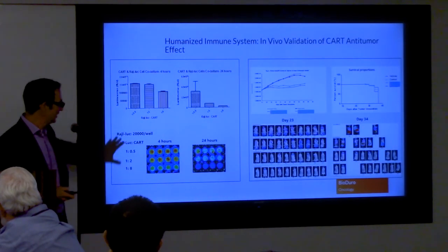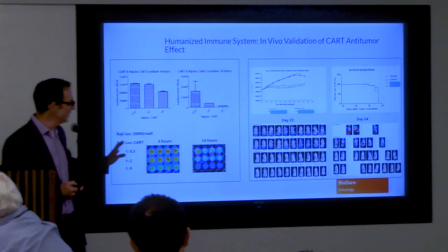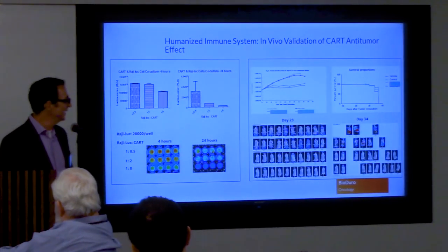When we translate this same data into the next step, which is an in vivo model, we really see very similar results. Very quickly, what you're looking at in that first row is a mouse that had this luciferase-tagged line grafted into it. You can see on day 34 there's a huge outgrowth of the tumor. The second row is a non-engineered T cell, a natural T cell that has not had the CAR T engineering performed. Tumor grows well. The next two rows show the CAR T functioning quite well. And this really recapitulated the data that we observed in our 3D ex vivo platform, so it's very confirmatory and validating.